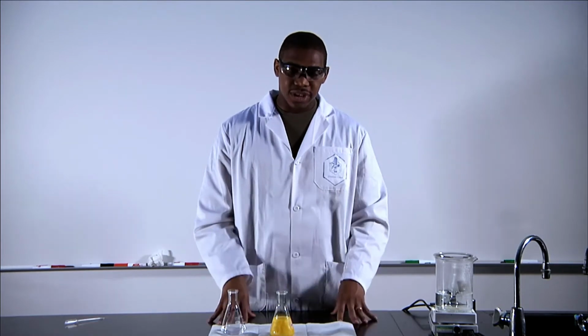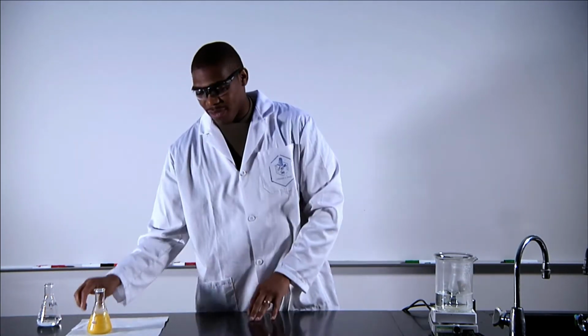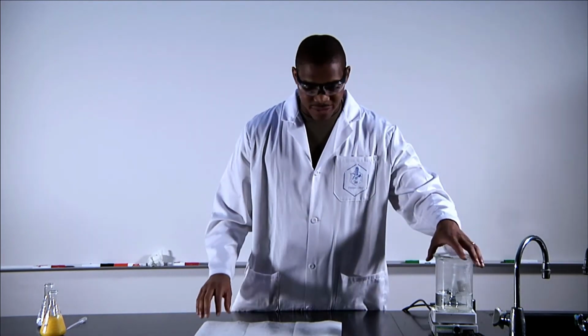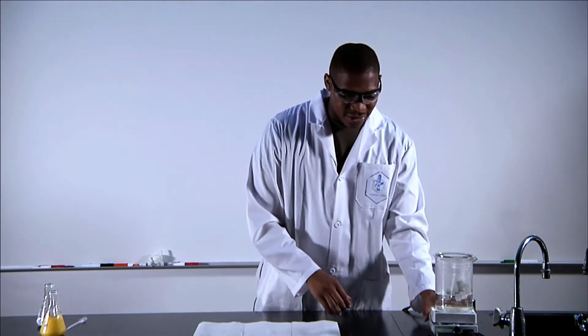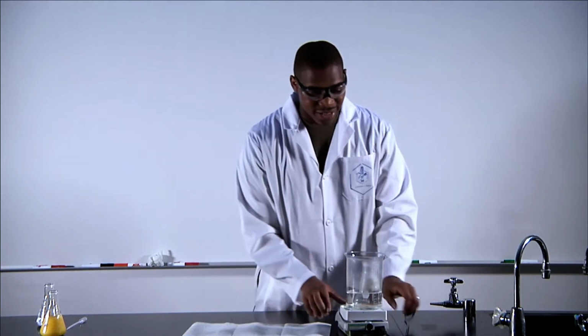So now that we have that, what we're going to do next is heat this up to show you how it redissolves in the solution based on temperature. All right, slide it over here. Don't touch the hot surface, that's a bad idea.